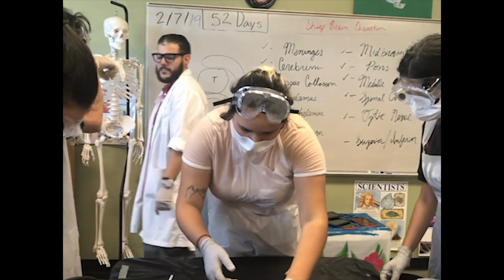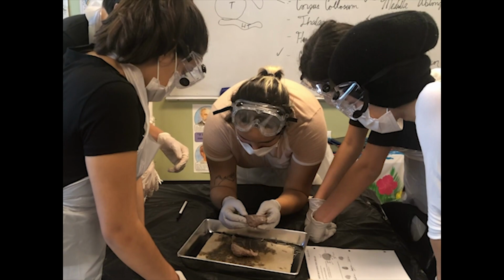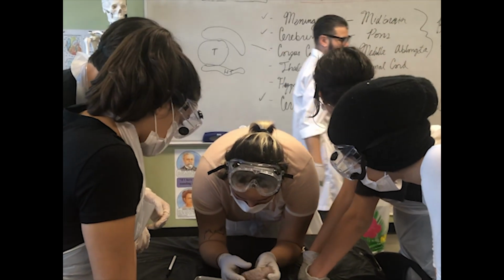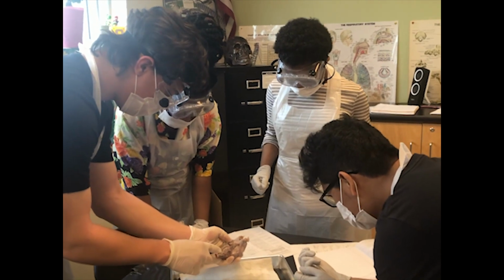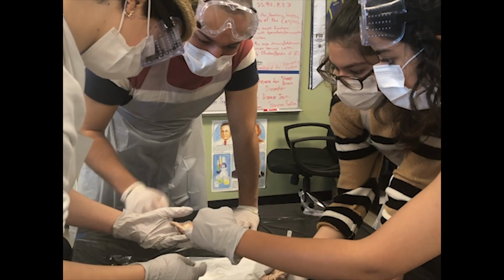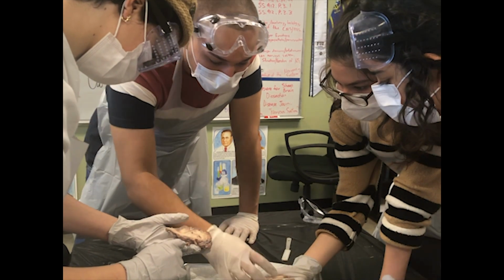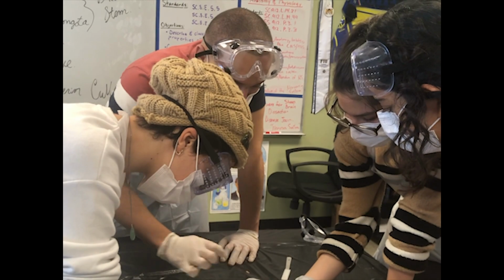I was waiting. You pull the cerebellum down. You haven't taken out the meninges. What is colliculus? I'm waiting. Colliculus. You want me to take it out? What is that? No, I don't think we're supposed to say that. Superior colliculus. And then the inferior. Yeah, remember? No, it's not this. Did we ever say what this was? No. But you said superior and inferior.